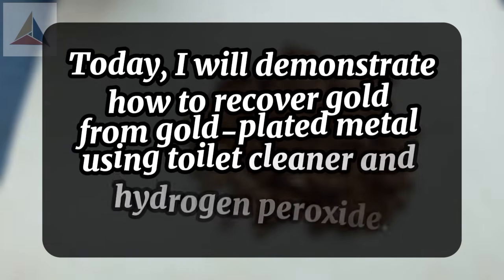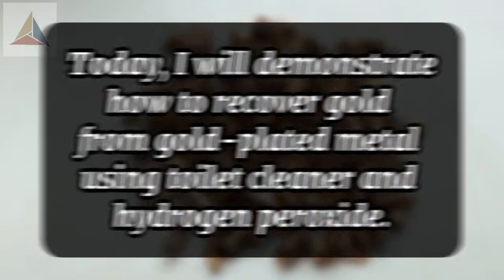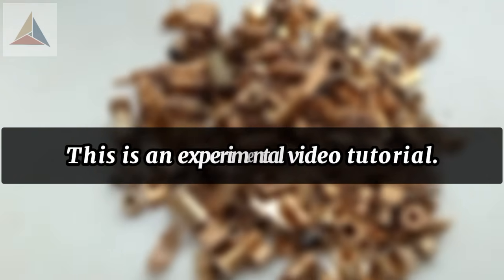Today, I will demonstrate how to recover gold from gold-plated metal using toilet cleaner and hydrogen peroxide. This is an experimental video tutorial.